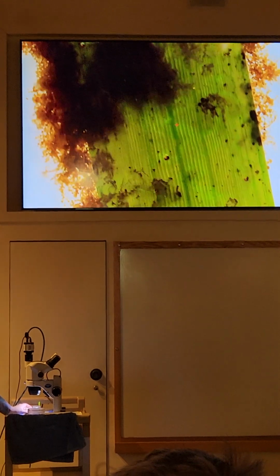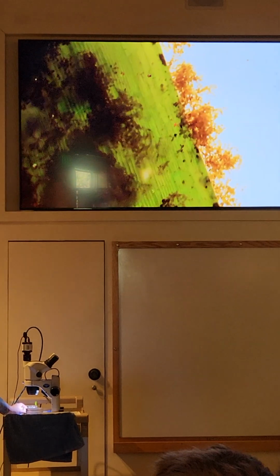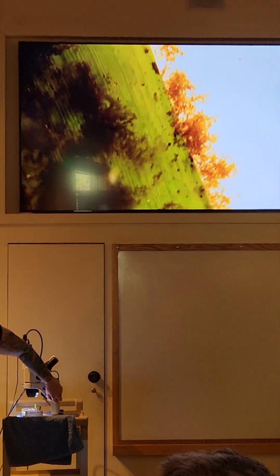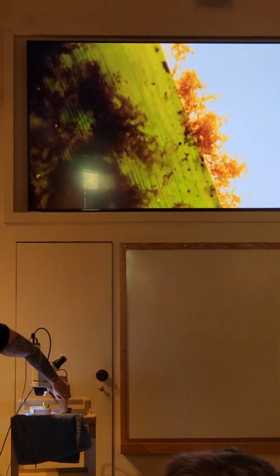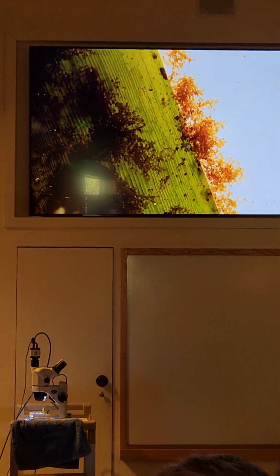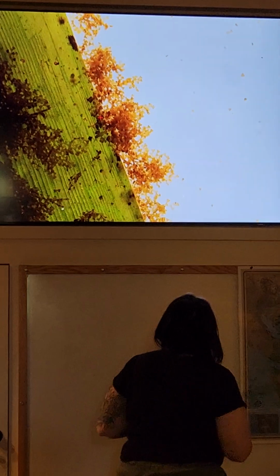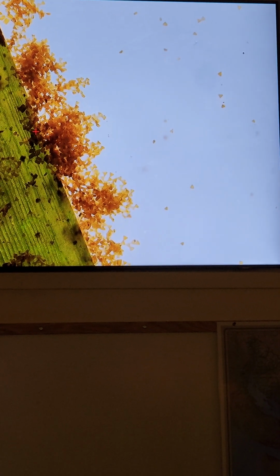I'll put this under the microscope in the microscope room so you guys can get a peek at it too. But what it really is, is an accumulation of tons and tons of these little diatoms. There we go, that's what I'm looking for. All of these triceratum are the kind of diatoms that they are. And when they float sideways, you can see that they have that dimension. They're three-dimensional, photosynthesizing. I think they're just absolutely beautiful to look at under a microscope. Just all those accumulations.